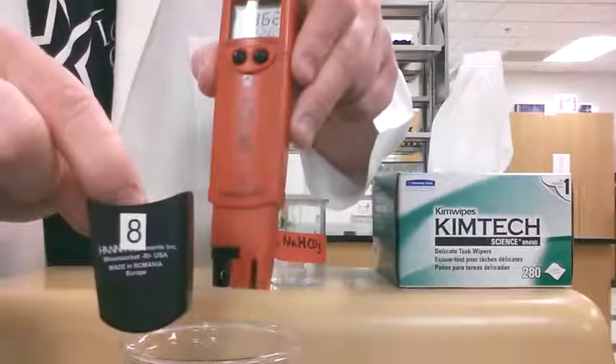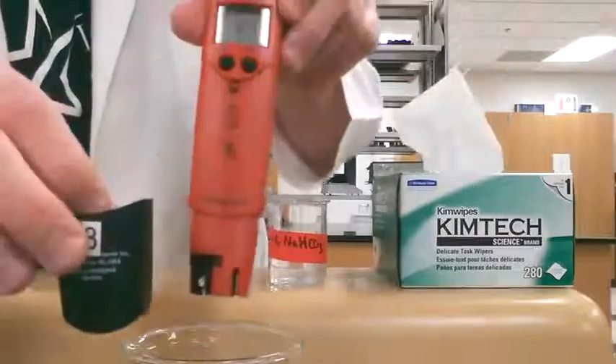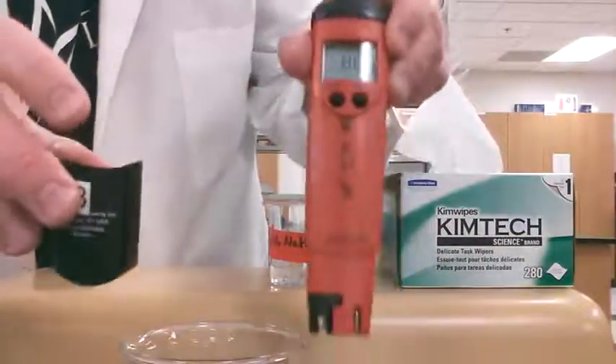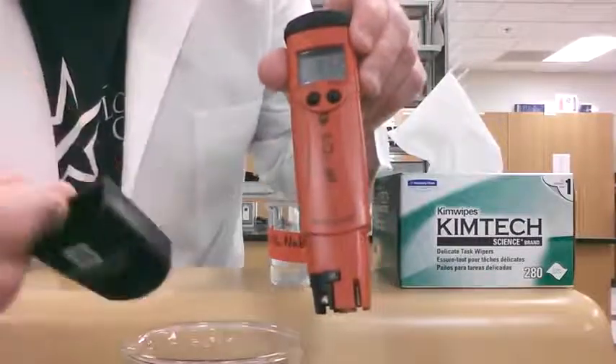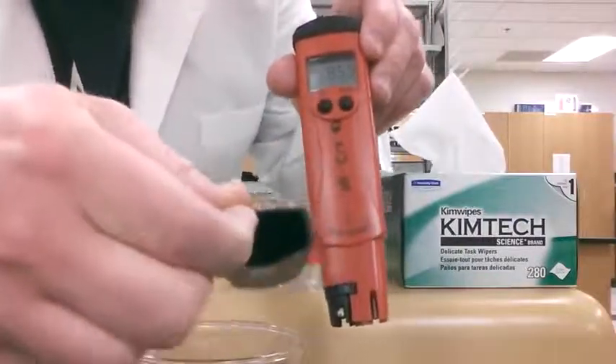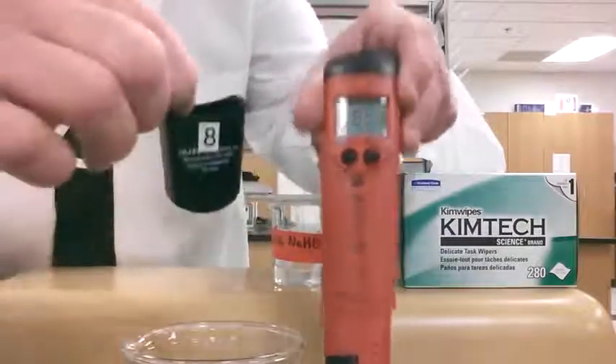After you've done that, you're ready to put your cap back on. The caps are numbered — this cap is number eight and this pH meter is also number eight. When you're ready to put it back on, you need to make sure that there's buffer solution inside that cap, in case we spilled any out when we were taking it off, which happens very easily.